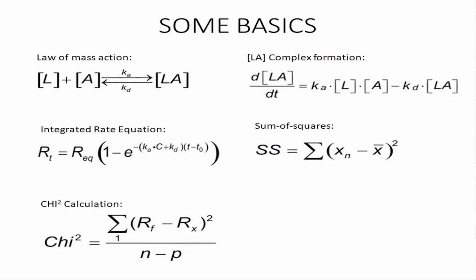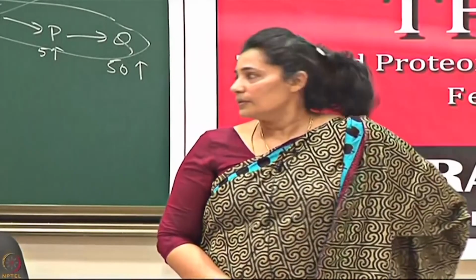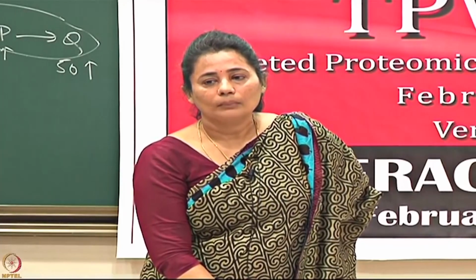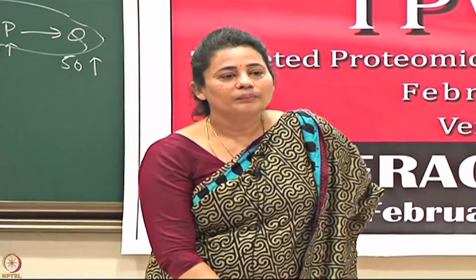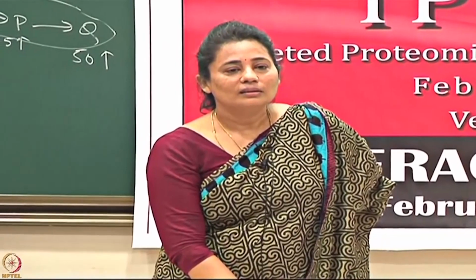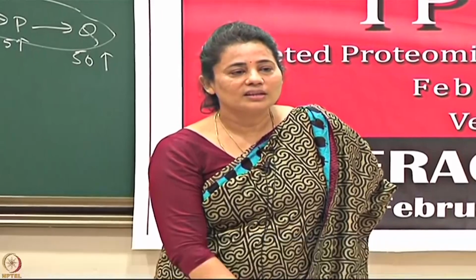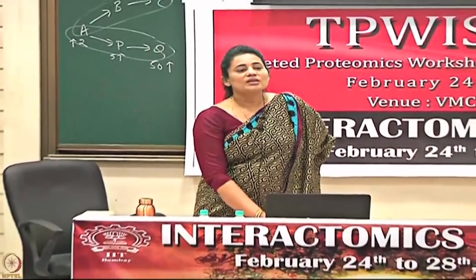You have to look at equilibrium, try to look at, and how do I enhance dissociation? Can I enhance dissociation? I can change the pH. Can I change anything else? Flow rate, very nice. Anything else? Why should I change pH?